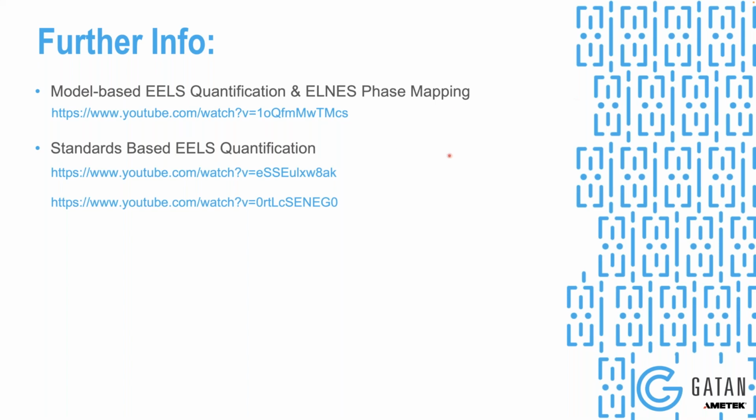That has recently been extended for another 3 months, I believe, and it should be on our website now. You just need to download the latest installer and rerun it to get that extension for the EELS plugin. A lot of the features, even without the COVID version that Liam was showing, are available with the totally free offline version.